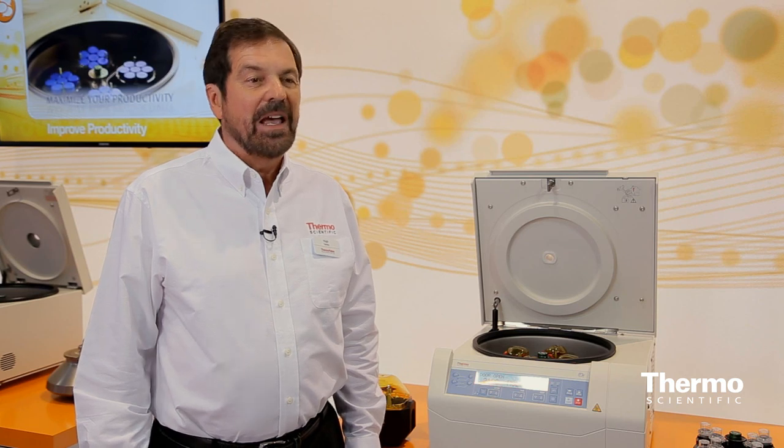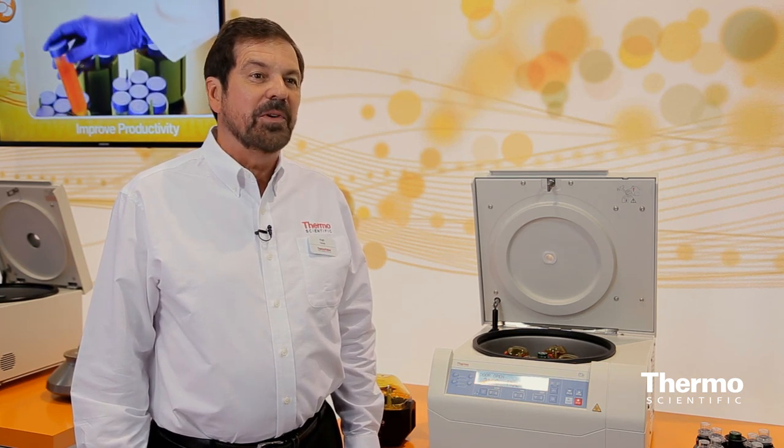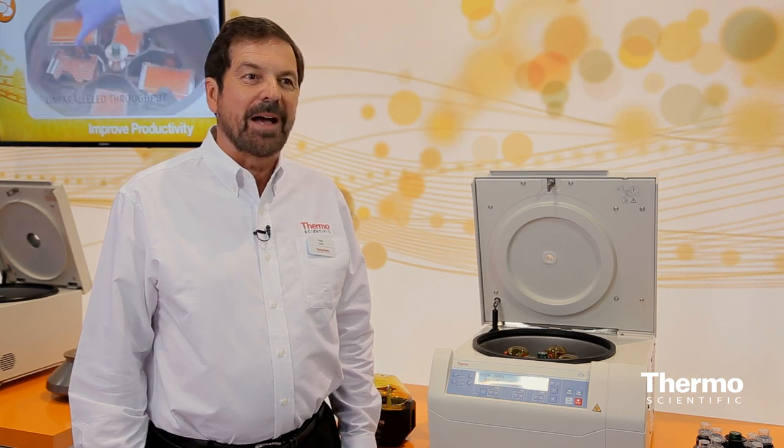It fits in and stands out. It fits in because it's a small size, and also because it really has a variety of adaptable rotors — 15 in total. With that number of rotors, we can really fit all the customer applications.